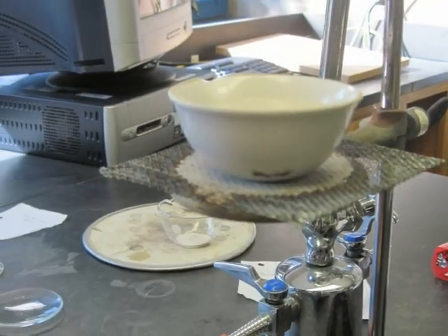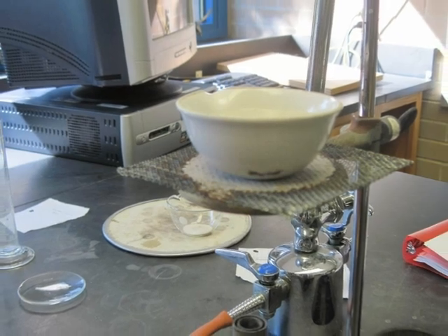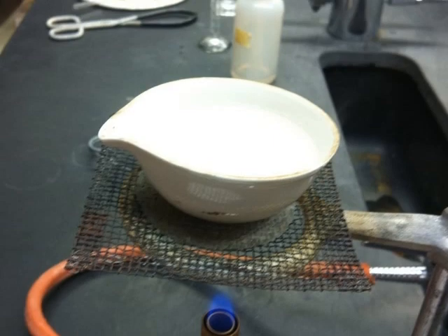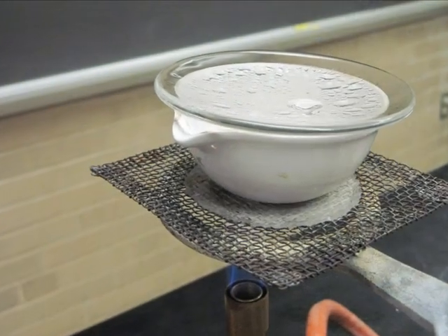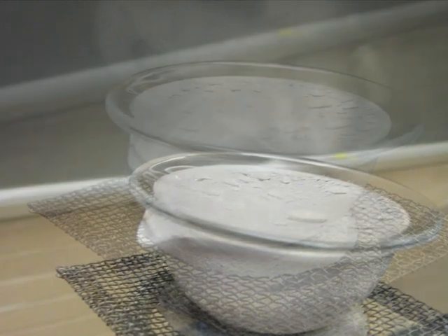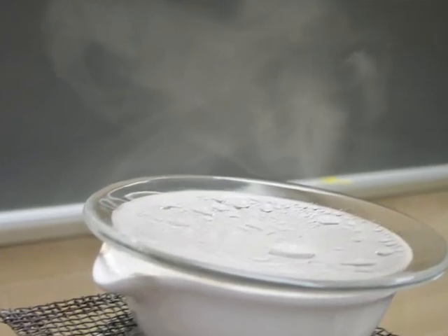Place the evaporating dish containing the salt water on the wire gauze on your ring stand. Heat the salt water gently without the watch glass cover until about half of the water has evaporated. Carefully place the watch glass on the evaporating dish. Steam will escape from the dish. Heat until the sample is completely dry.